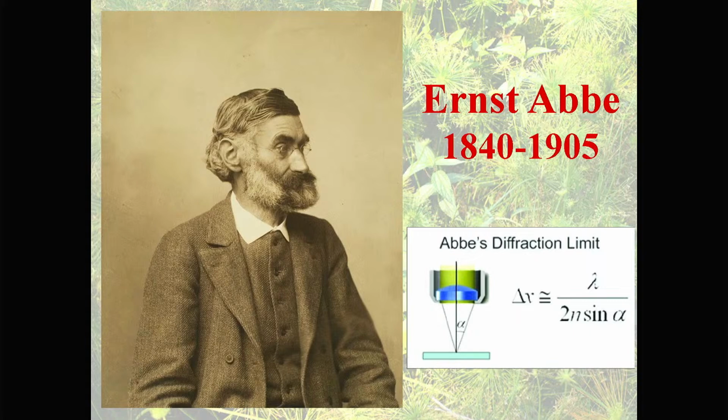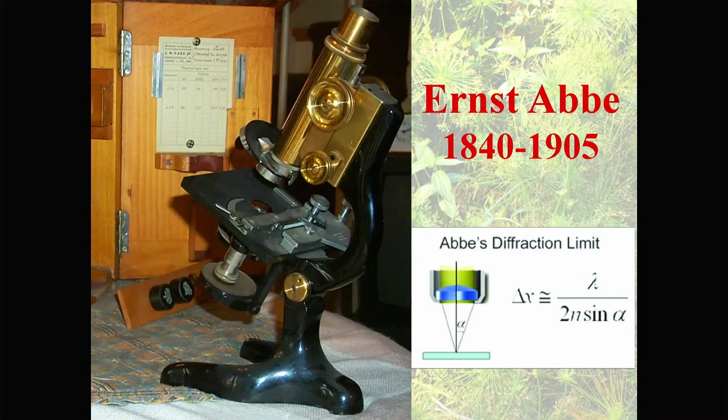So here, this is classical. We're now going back to basics, and we have here Ernst Abbe and his Abbe diffraction limit, and what it looks like in a light microscope. It depends on the aperture of the microscope.